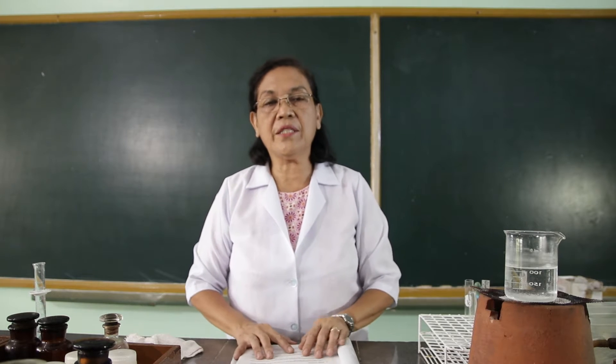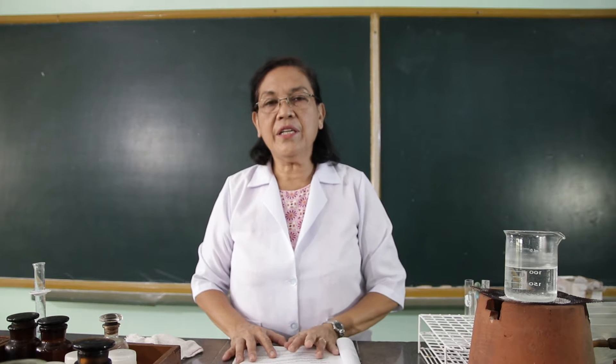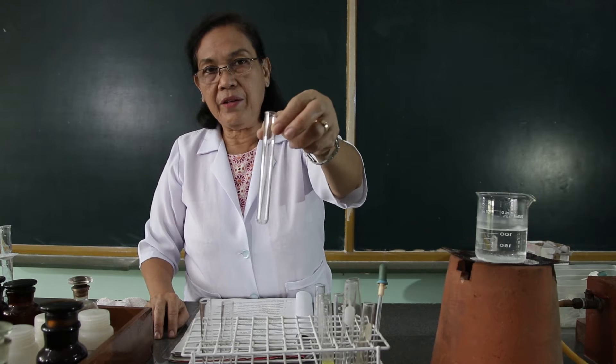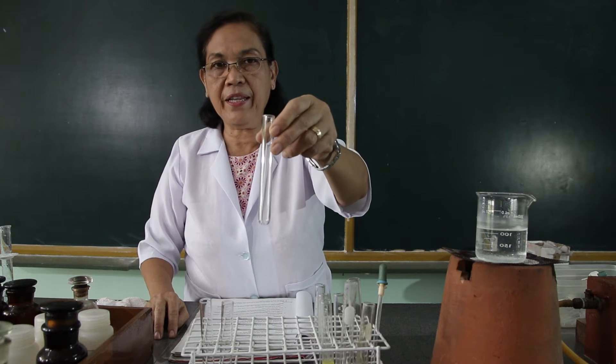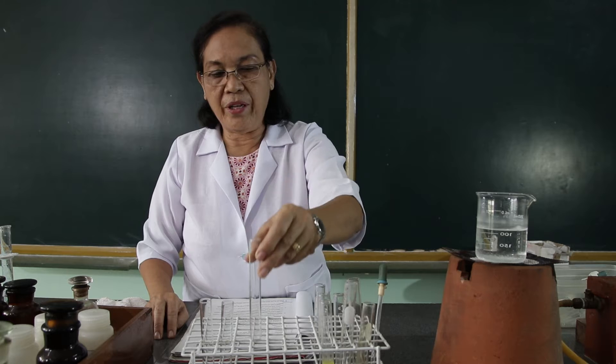The next procedure is to test the oxidation reaction of the alcohols. In this procedure, we are going to use the ethyl alcohol, the isopropyl alcohol, and the tertiary butyl alcohol. We will place these three different kinds of alcohol in three different test tubes. For this first test tube, we are going to fill this with ethyl alcohol.